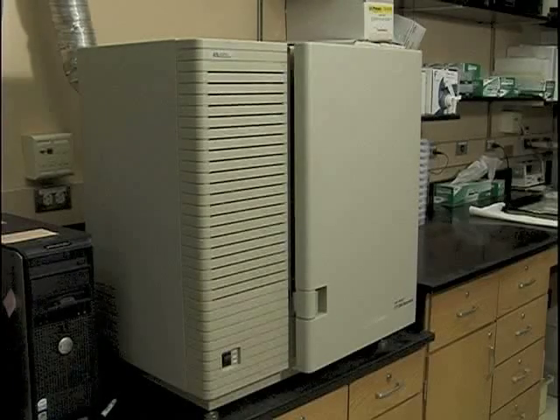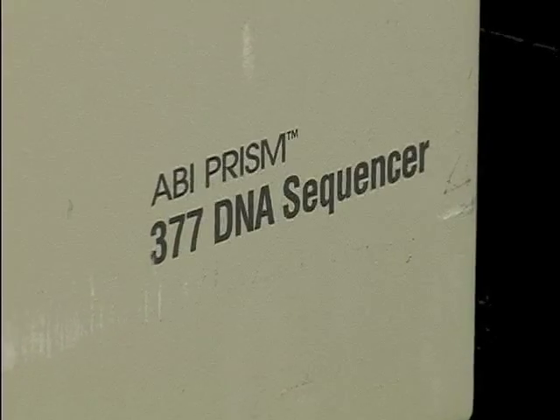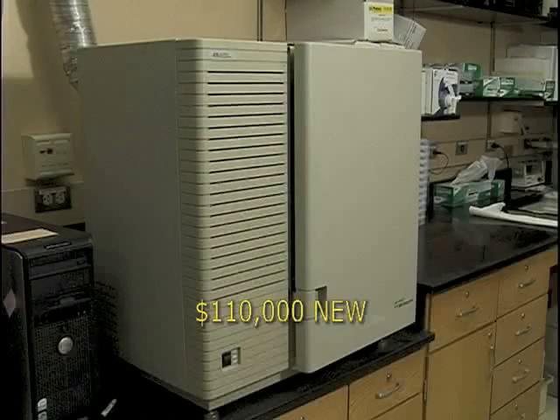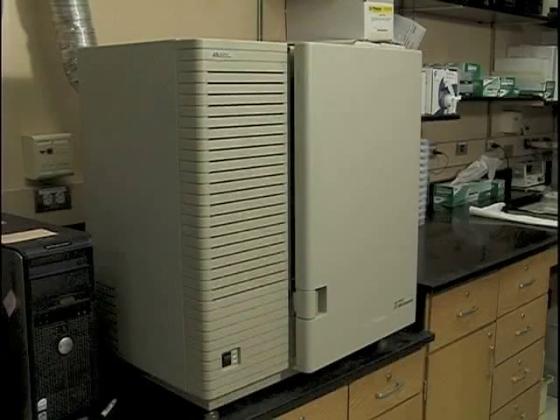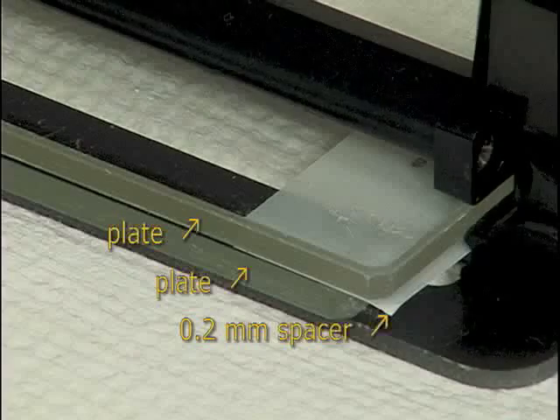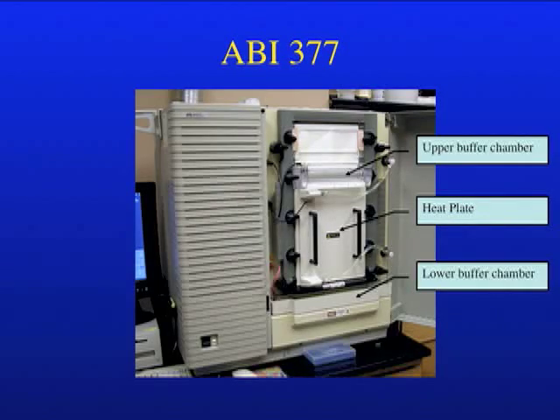Until about 10 to 15 years ago, all DNA sequencing was done on slab gel-based sequencers like this — the Applied Biosystems 377 DNA sequencer. When new, it cost about $110,000, and at one time the facility had three of these. Much of the human genome was completed using these instruments. The polyacrylamide gels were poured between two optical quality glass plates using a 0.2 millimeter spacer — very thin gels. Once the gel polymerized, it was mounted in the sequencer and the upper and lower buffer chambers were attached. A heat plate was placed over the front of the glass plates to keep the gel at a uniform, optimal, and reproducible temperature for electrophoresis.